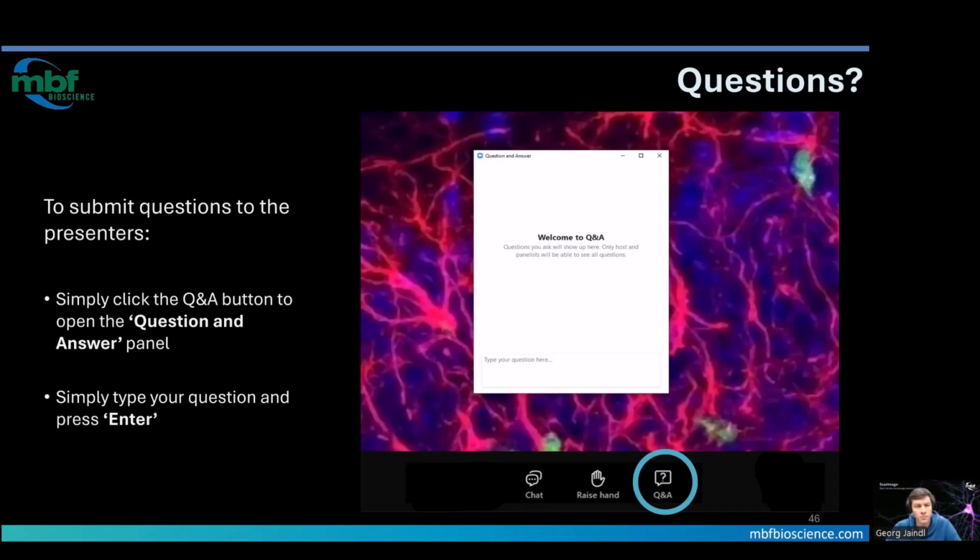One question related to the compatibility of scripts that users might write to automate their workflows. The question is, are those scripts still compatible with the new ScanImage version? In doubt, you can always reach out to us and we can help you modify your scripts to be compatible. But the general guideline is that the backend of ScanImage itself has not changed or not changed much.